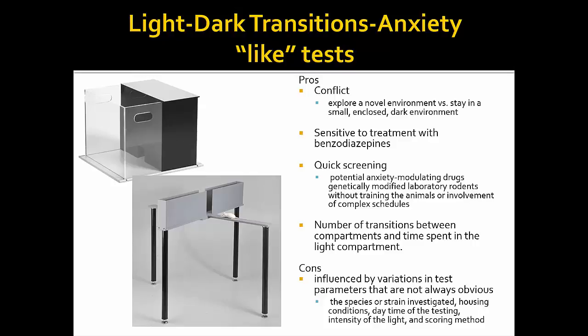And in the case of the elevated plus maze, you add the height factor to it. So you've now put them in, they're scared, they're on this high, little short beam, and then you're also involving this need for them to explore. And these tests are considered anxiety-like tests because they're sensitive to treatments with benzodiazepines. So if you administer benzodiazepine to an animal, you'll find that they will go out more in the light area. They'll go out more into the open arm.